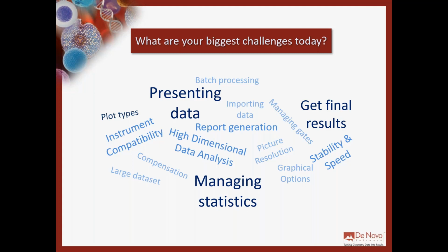The examples that I put together are focusing on what I think are the main hurdles in the daily practice in flow and image cytometry. So like, for example, presenting data, managing statistics, high dimensional data analysis. And overall, I would summarize all those points as getting the final results. So this is the main point for everyone, not only in flow cytometry at the end.